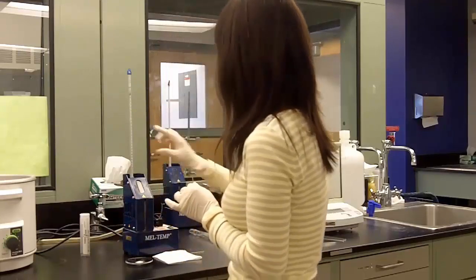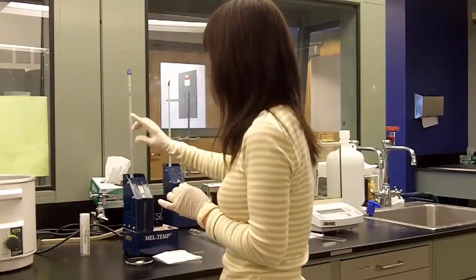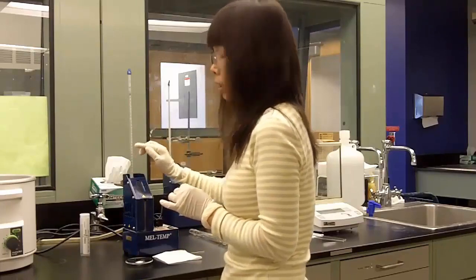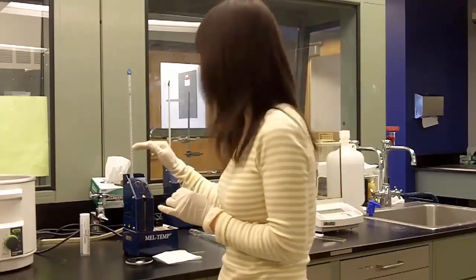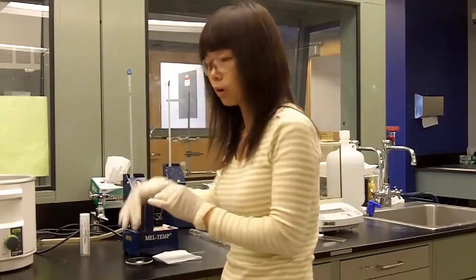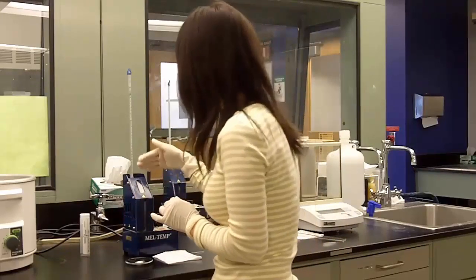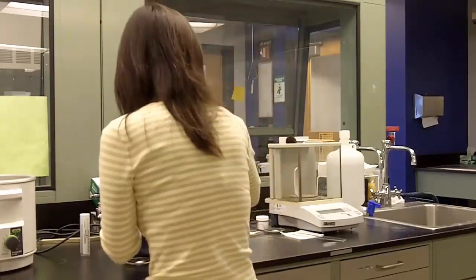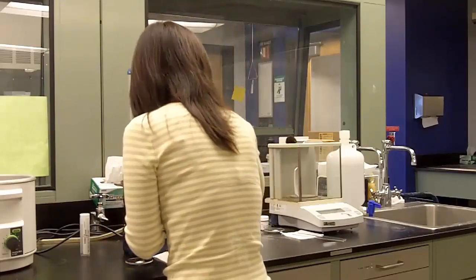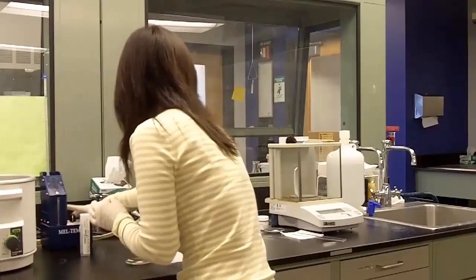And now we put this sample in. Now you need to be careful. If the temperature is still high, you need to wait until the temperature drops about 30 degrees below your melting point. That means the temperature has to be below 70 degrees for our unknown. So the temperature is about 120 degrees now, so it's still very high. And we are going to use a different melt temp to save time.